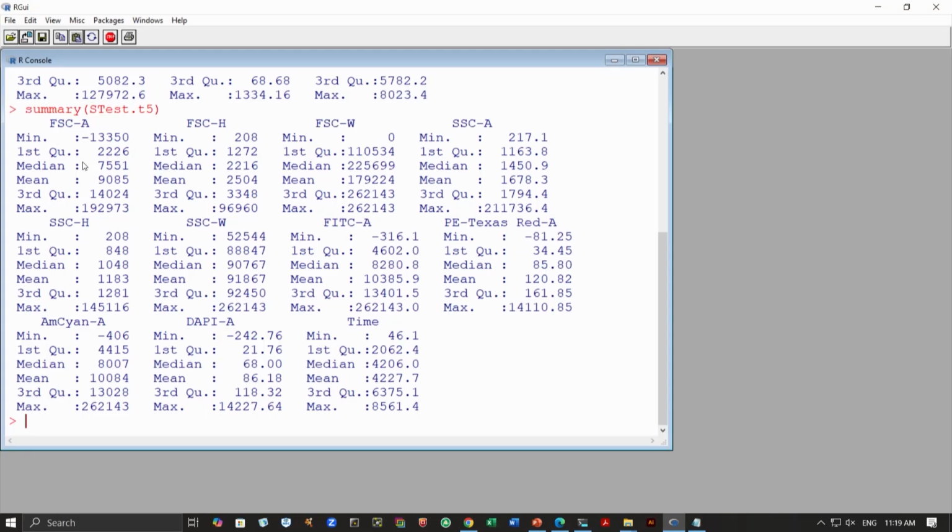Take all of FITC and all of these cells, all the events, all the observations that we have. We have to carefully test first whether these observations look okay, because you get cellular debris and a lot of background noise, and we need to filter those out. Otherwise that will influence the final outcome of the experiment, or the results that we get from this analysis. In addition, we also have cell aggregates. When we prepare the samples, we vortex etc., but we still have some aggregates in there, so we also have to do aggregate filtering.